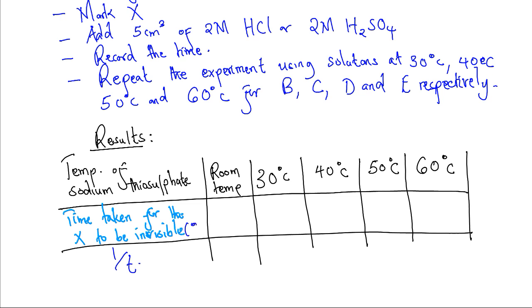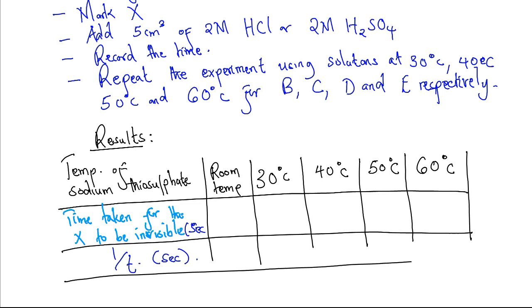This is in seconds as well. So this is the experimental results. We want to record the result in this table.